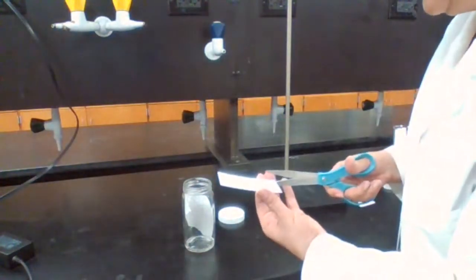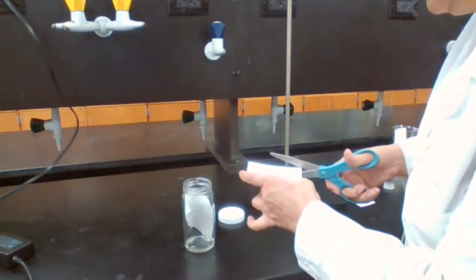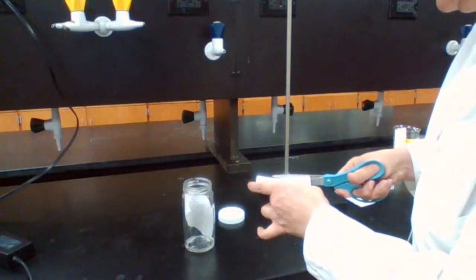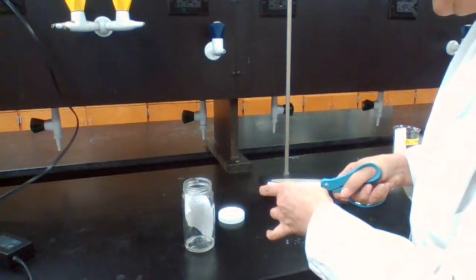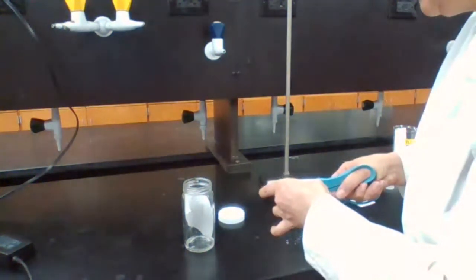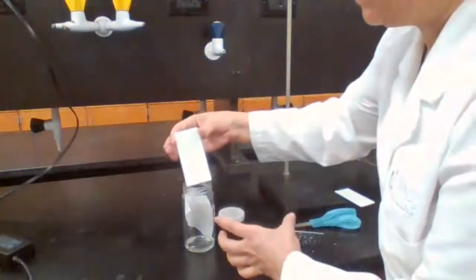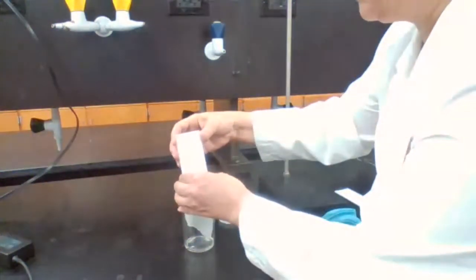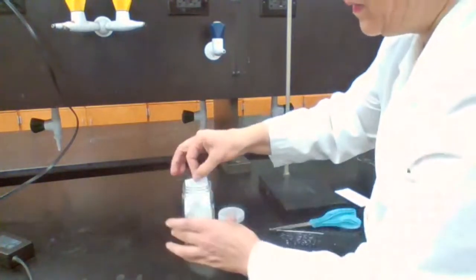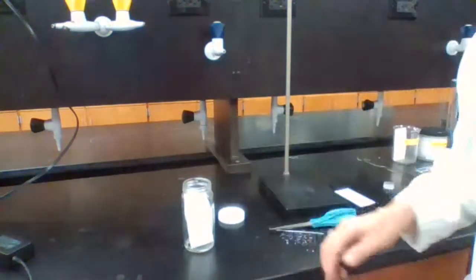I'm going to have to cut the side because it doesn't fit into the jar and I don't want to bend it, because if I bend it, the solvent is not going to move up straight. Okay, it's going to stay in.